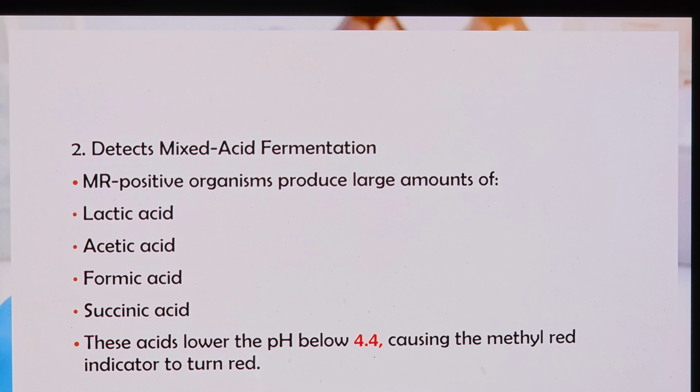It detects mixed acid fermentation pathway. MR positive organisms produce large amounts of acids like lactic acid, acetic acid, formic acid and succinic acid. These acids lower the pH below 4.4, causing the methyl red indicator to turn red.